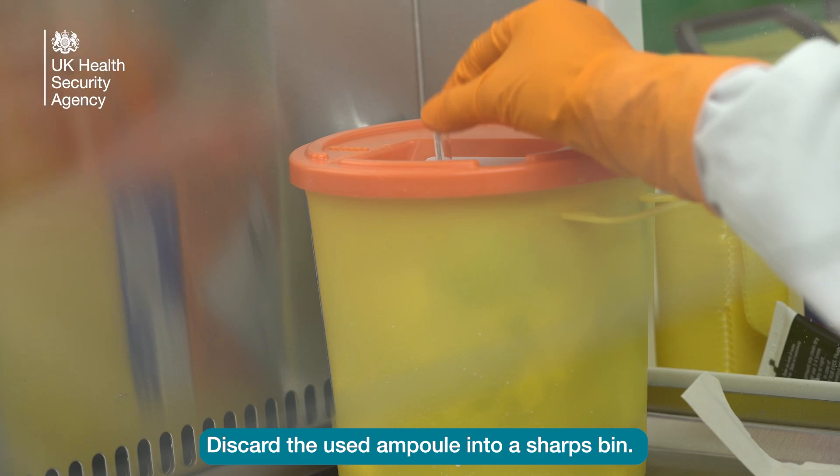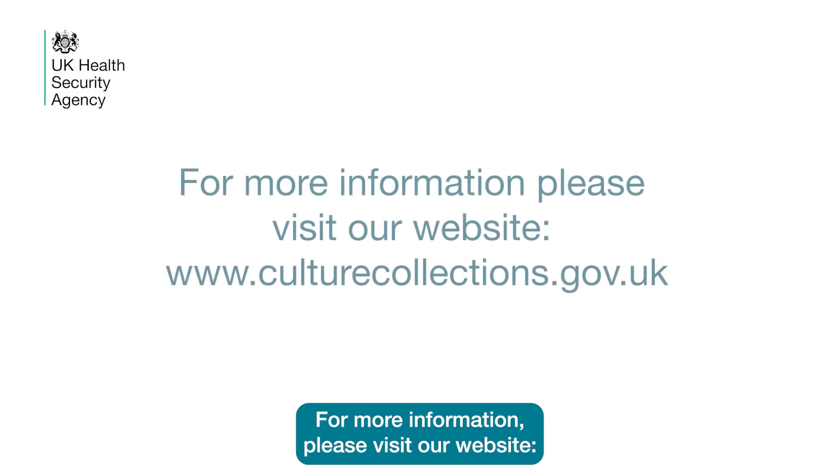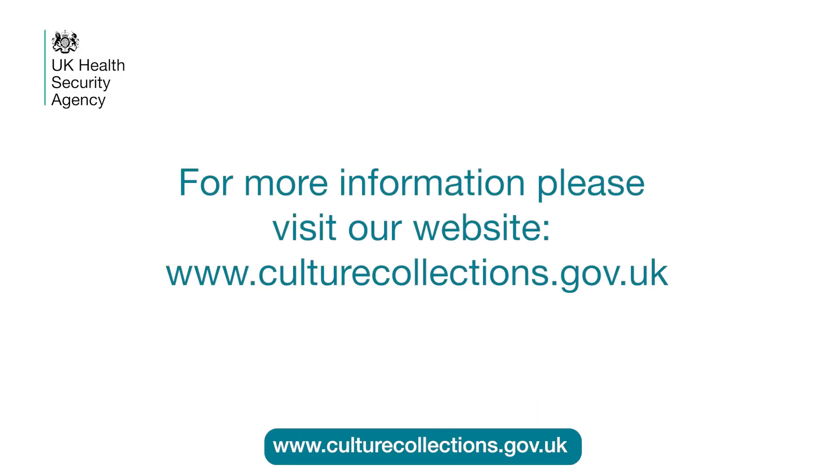Discard the used ampoule into a sharps bin. For more information, please visit our website at www.culturecollections.gov.uk.